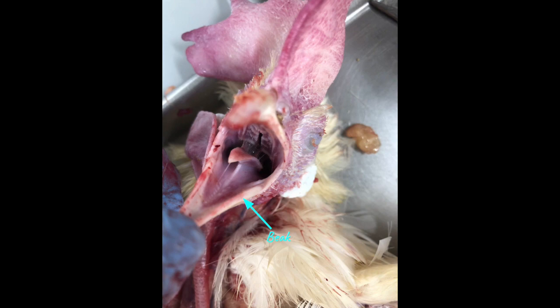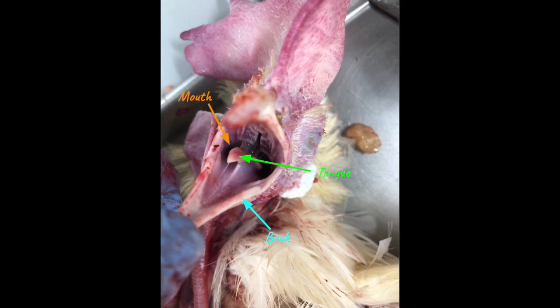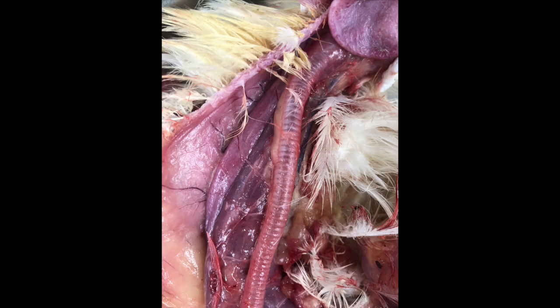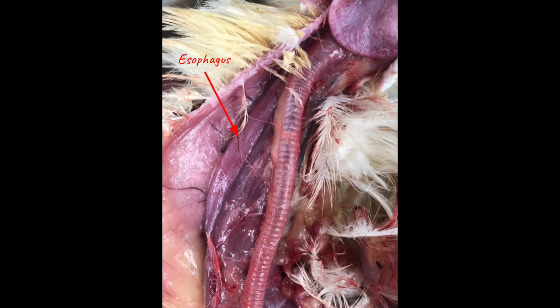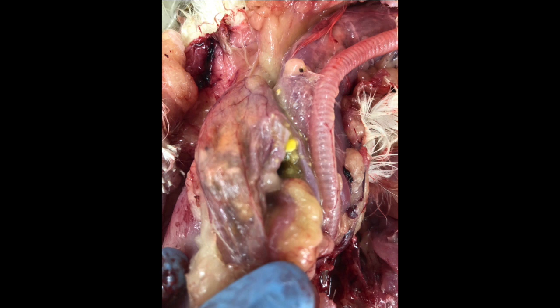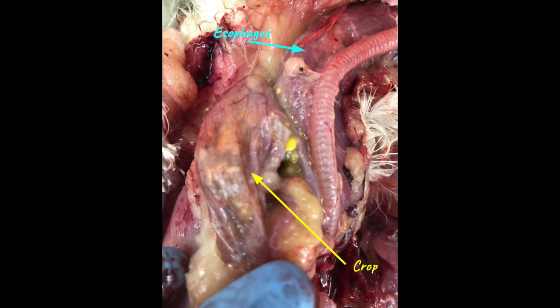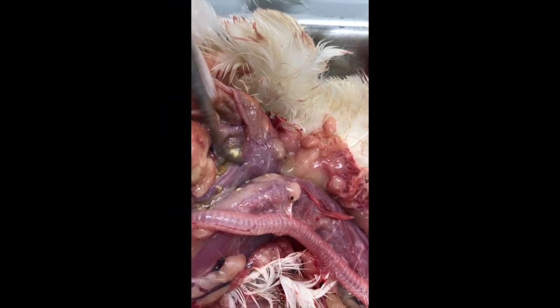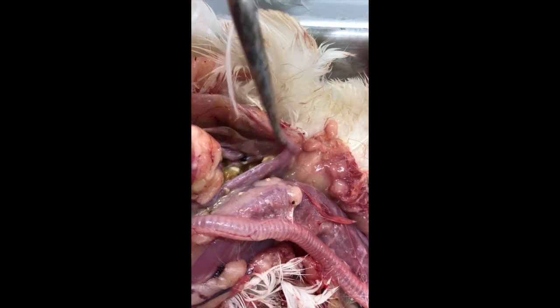Here you can see the oral cavity. The beak is used to crush, hold, and tear food, and there are very few muscles in the tongue. Once food is swallowed, it goes through the esophagus, which is a muscular tube dorsal to the trachea.